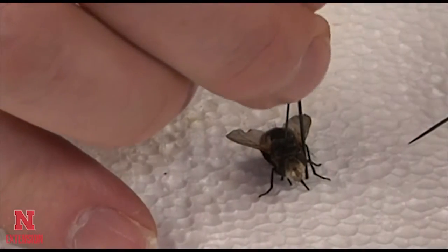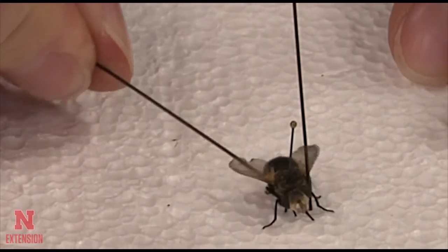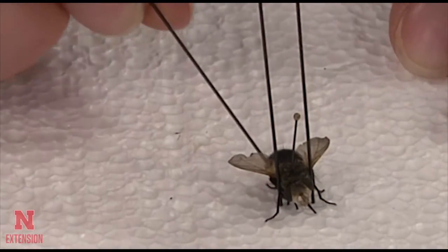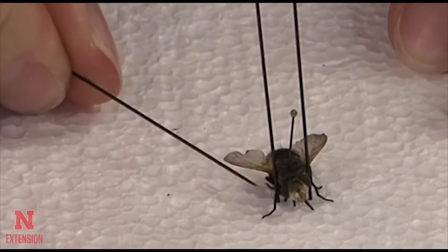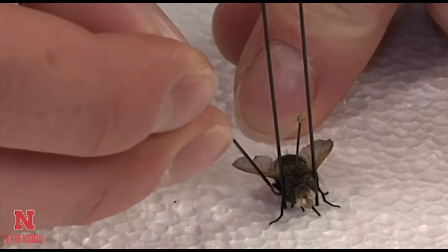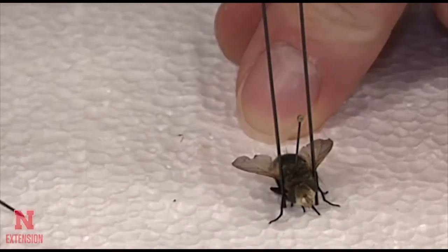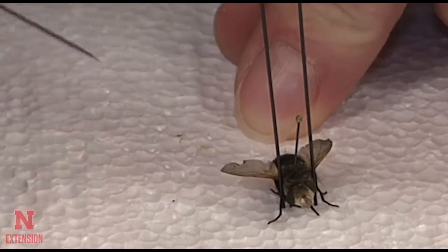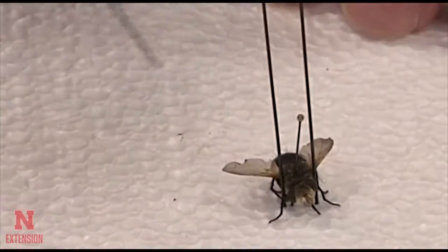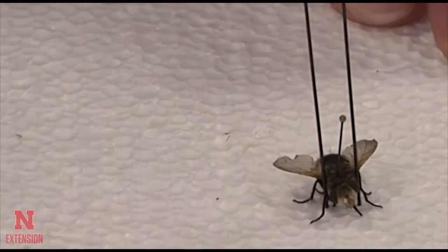Sometimes you may need to use pins to hold the body in place, to keep it from rotating on the pin and to keep those legs where you position them. The claws on the end of the leg will often work to your advantage and hold the legs where you position them on the styrofoam.